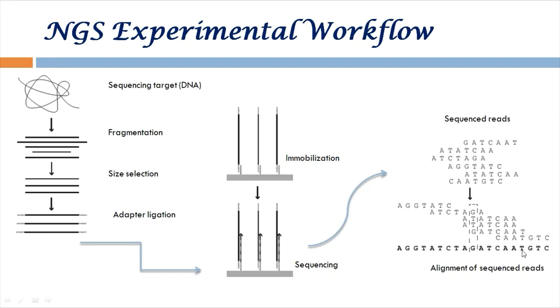What it means is, this particular T that is present in the reference genome has two fragments supporting that. Alright? So here it is 2x. Here there will be many, but we'll just consider this, because we are going to have a few million reads. Everywhere there will be fragments, but just consider a small scenario like this. Alright, so 4x here, 4x here, 4x here, 2x here, 3x here, 4x once again here. Sometimes there could be mismatches, we will come to that later on.